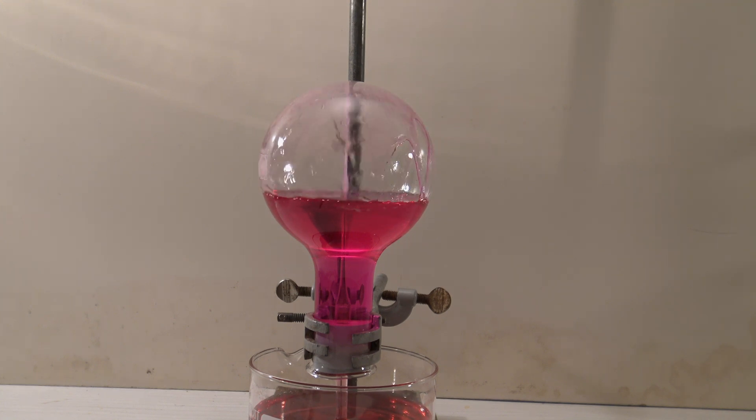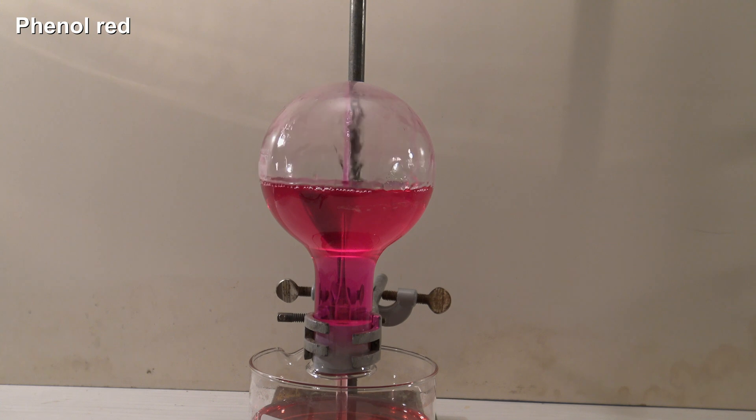Usually phenolphthalein is used as the indicator because it is colorless at a neutral pH and turns pink in a basic solution, but in this case phenol red was used.